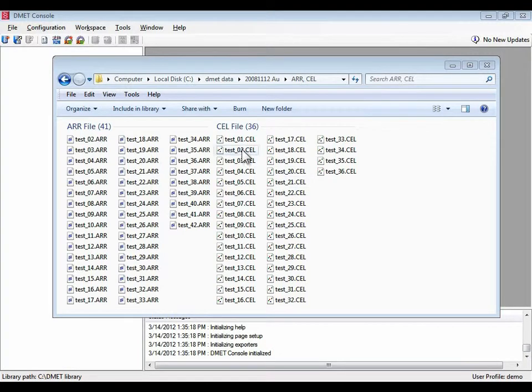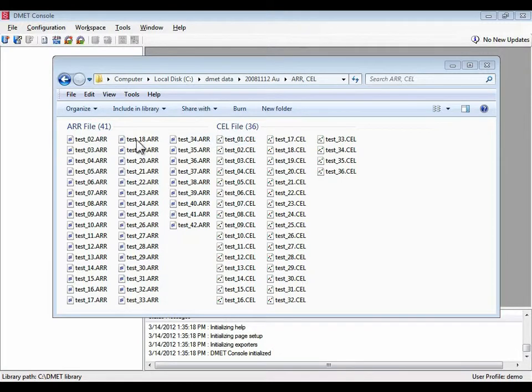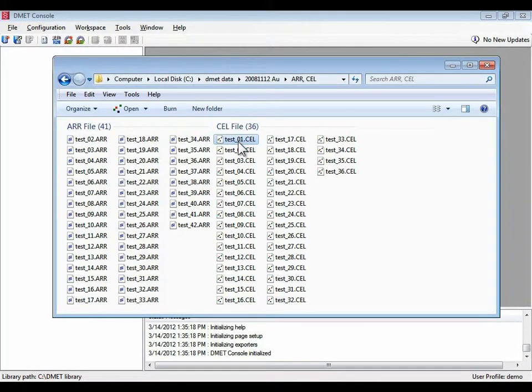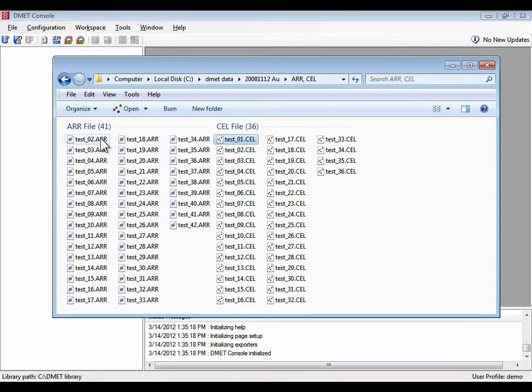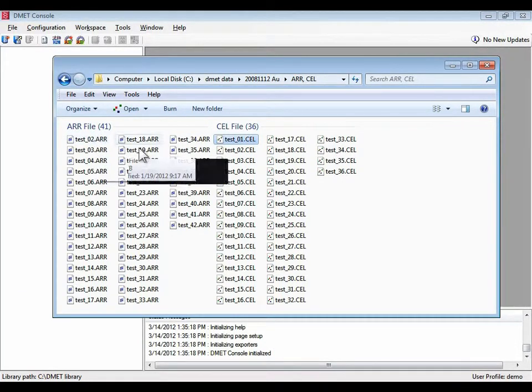Specifically, DMET Console requires that for every cell file that you want to genotype, you need a corresponding ARR file. You can see in this example that the test01 cell file does not have a corresponding ARR file.